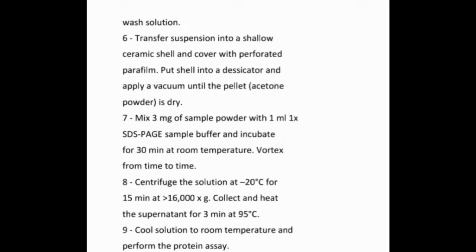8. Centrifuge the solution at -20 Celsius for 15 minutes at more than 16,000 xg. Collect and heat the supernatant for 3 minutes at 95 Celsius. 9. Cool the solution to room temperature and perform the protein assay.